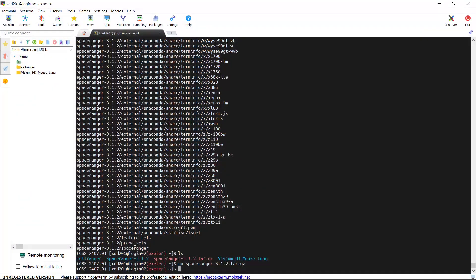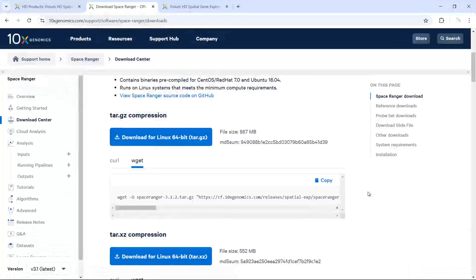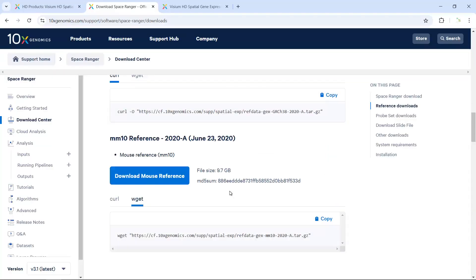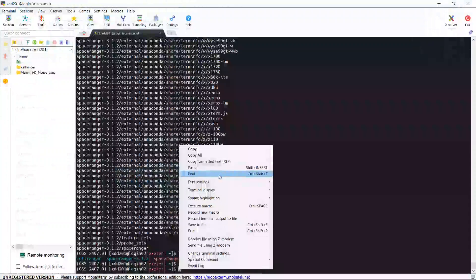Next we need to download the reference data. For my demonstration, I'm going to use a VGM-HD mouse dataset, so I need to download the mouse reference data from the 10x Genomics website. We can scroll down and see the reference section. Here is the human reference — if you have a human spatial dataset, you need to download the human reference data. Because I'm using the mouse dataset for demonstration, we need to download the mouse reference dataset. So we can copy the link again and download the mouse reference data.